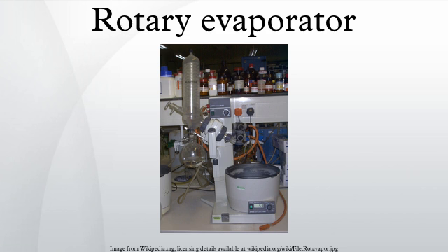Users of rotary evaporation equipment must take precautions to avoid contact with rotating parts, particularly entanglement of loose clothing, hair, or necklaces. Under these circumstances, the winding action of the rotating parts can draw the users into the apparatus, resulting in breakage of glassware, burns, and chemical exposure. Extra caution must also be applied to operations with reactive materials, especially when under vacuum. A leak can draw air into the apparatus and a violent reaction can occur.